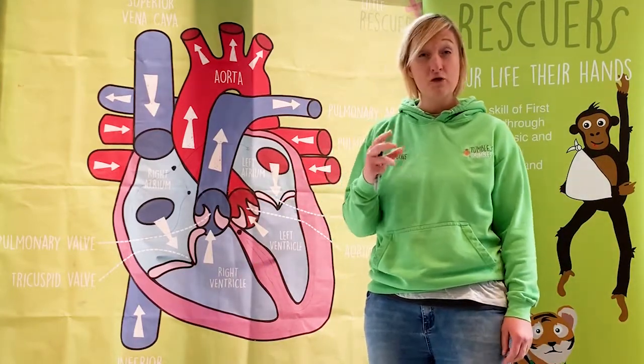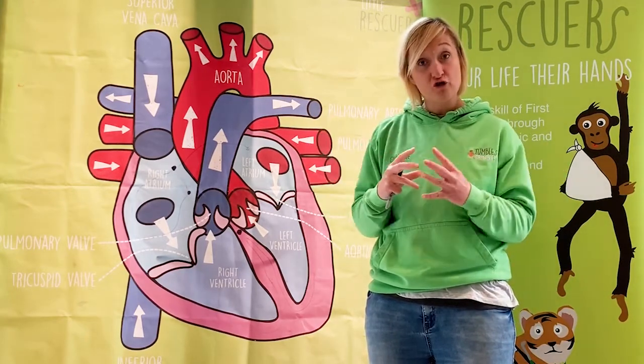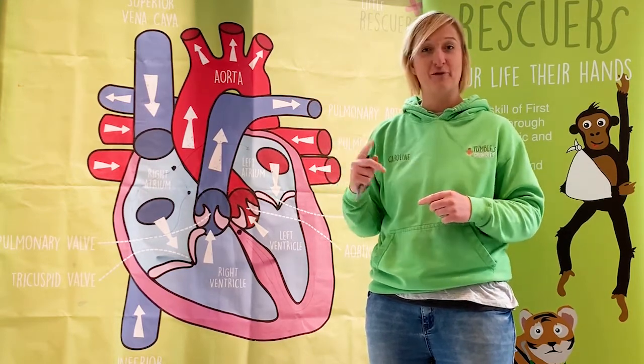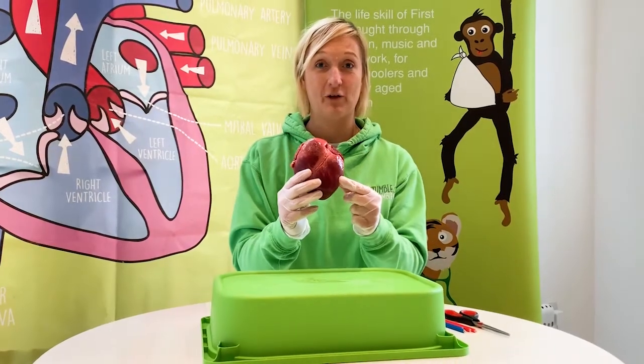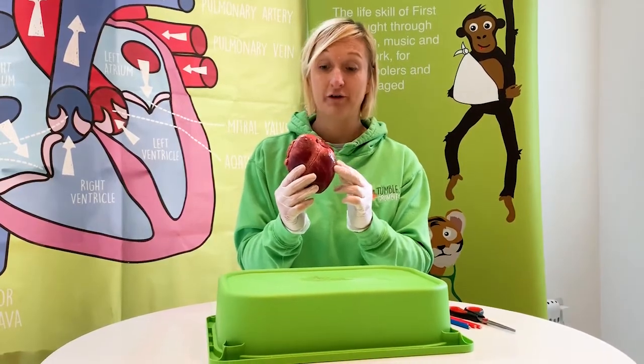So that really helps your heart to beat, or what is called contract, to move the blood through the heart and then through the body. This is the heart that we are going to dissect and have a look at. So this is the sheep's heart. Remember I said it's about the size of your fist? This one's quite a big heart.